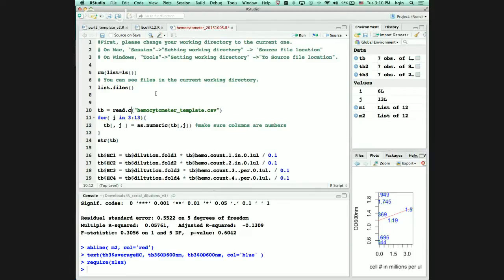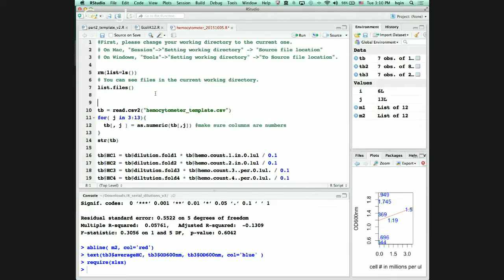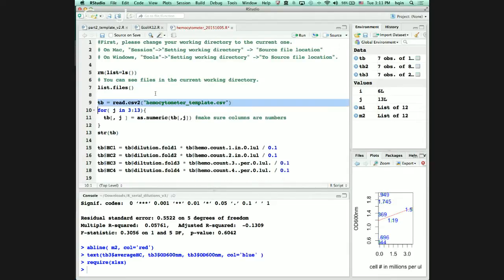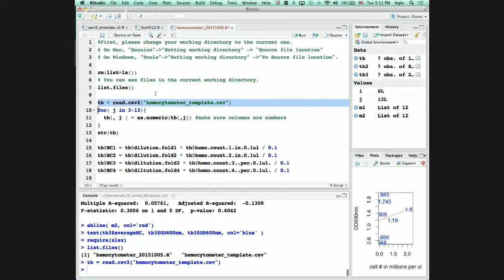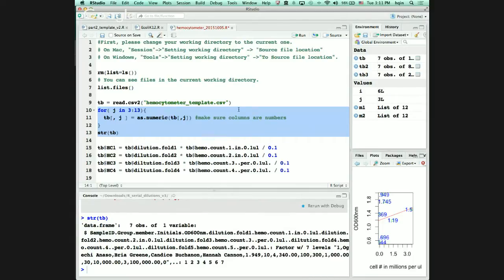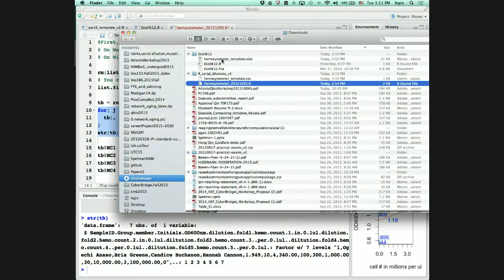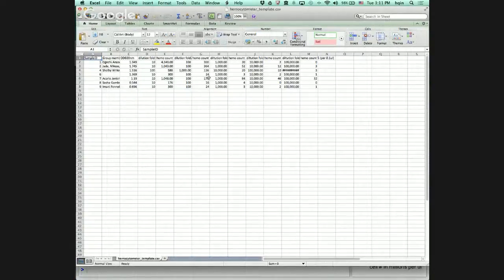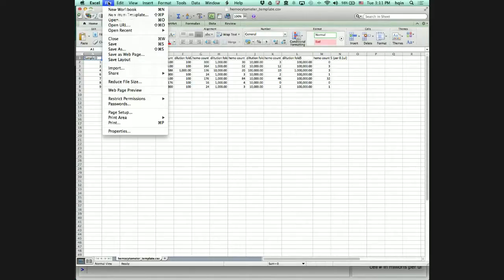If you already ran the Excel file, you can still run it. Let me see. The Excel file is the data. Oh no, that is not right. Let me see. This is not right.